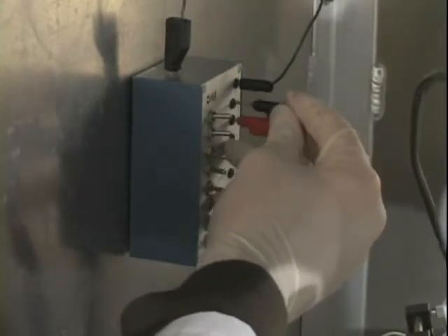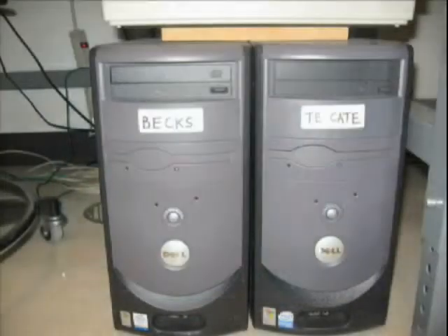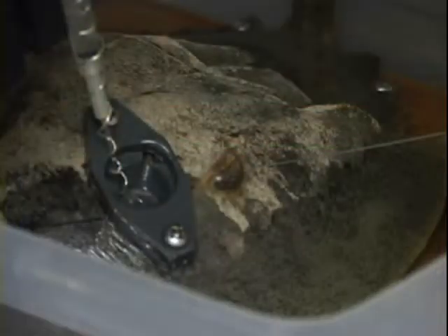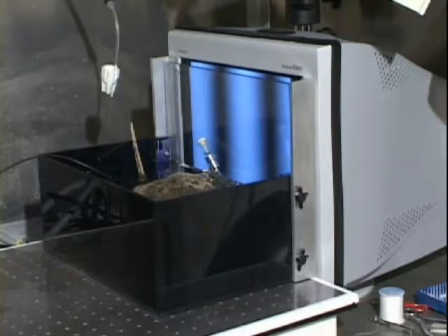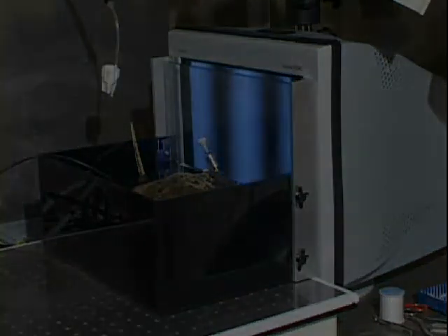The signal and reference leads are connected to the head stage of a differential amplifier for signal amplification and noise filtering. The amplifier output is passed on to an oscilloscope for viewing and a data acquisition card for computer analysis and storage. We use a custom-made program written in LabVIEW to control light stimuli and a digital spike discriminator to record spike trains. A fiber optic light pipe is employed for single cell illumination, whereas a computer controlled video display is used for pattern stimulation. With optic nerve recordings, one can study signal transmission between the eyes and the brain.